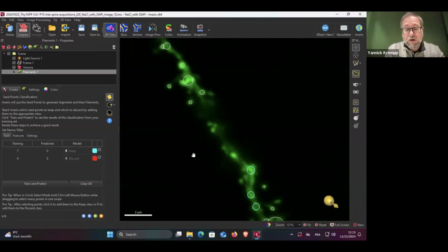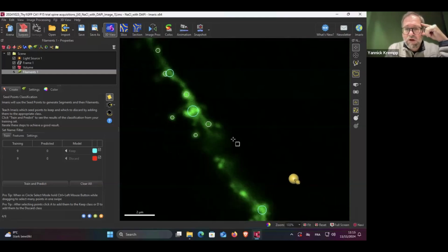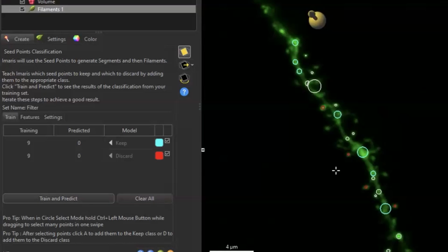In this case, I would probably use 10 or more examples, if possible, to do the training. Here I have 9 and 9. Let's assume this is okay. And let's train and predict. Let's see how it does.